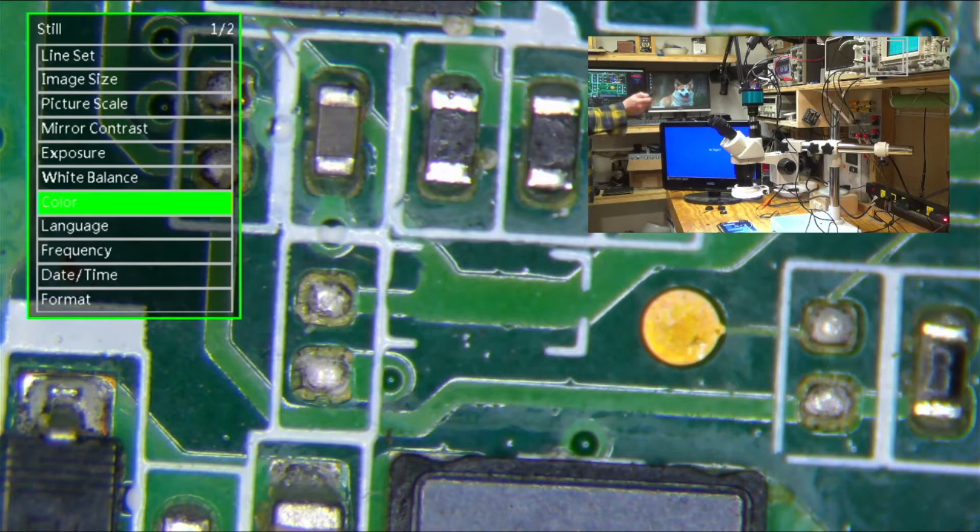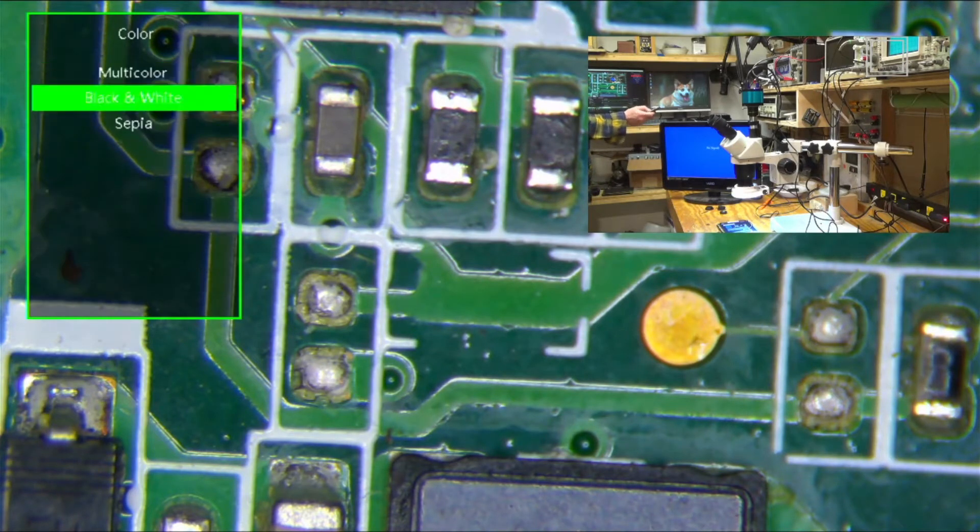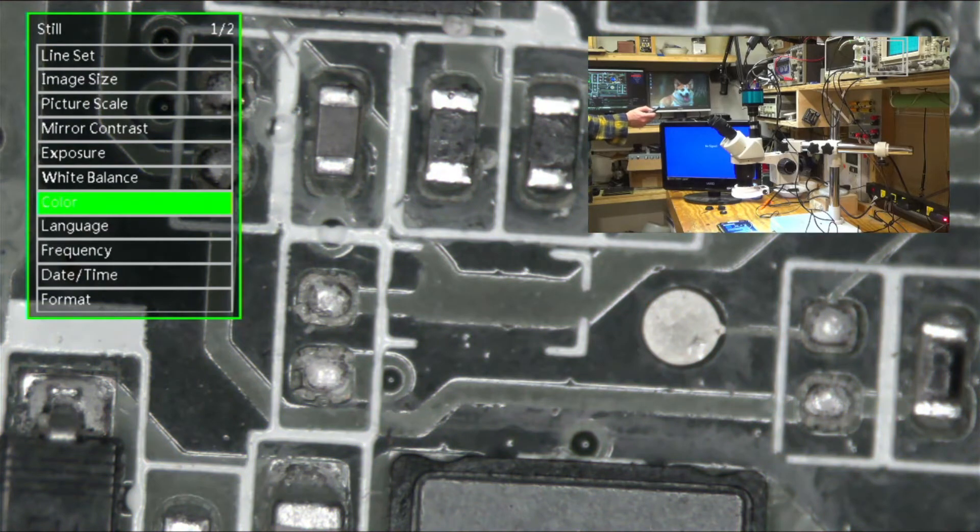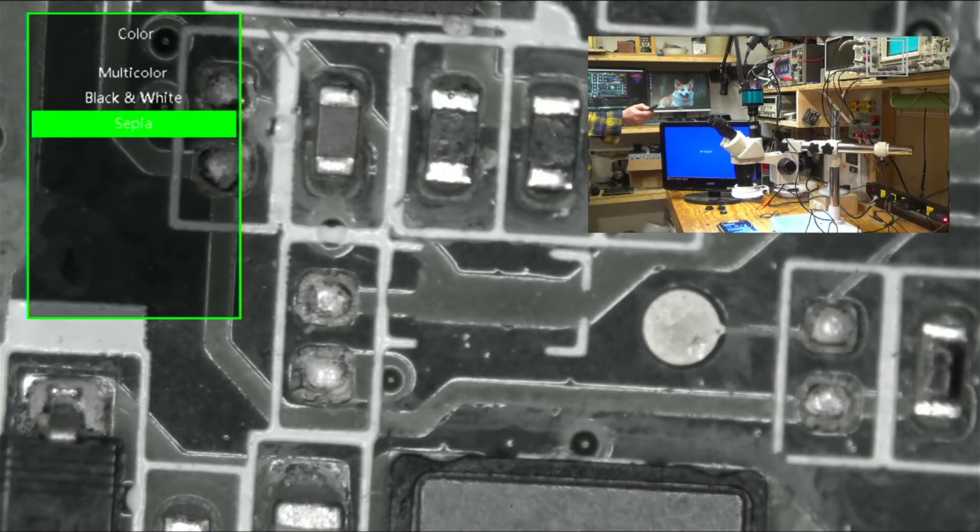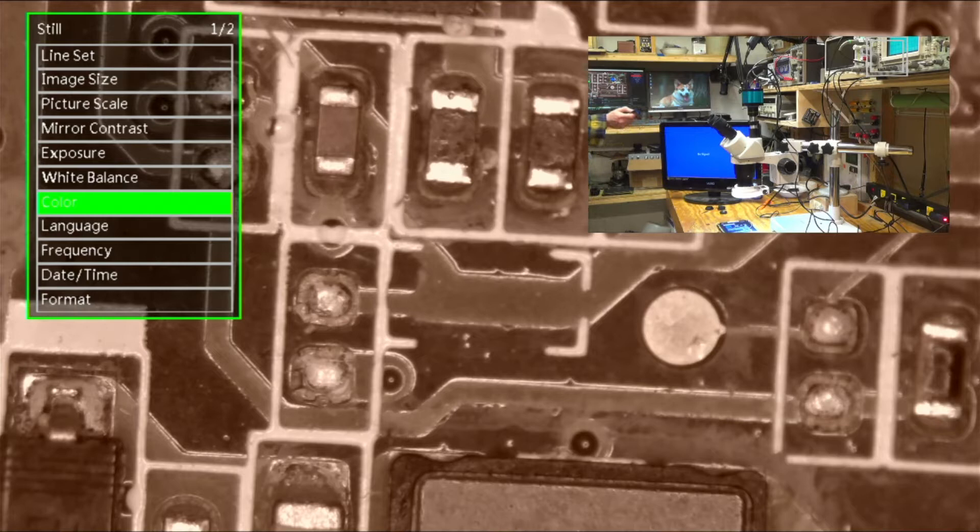So it's lined, so yeah, there's a bunch of different settings. Let's see—black and white. Oh, fancy!